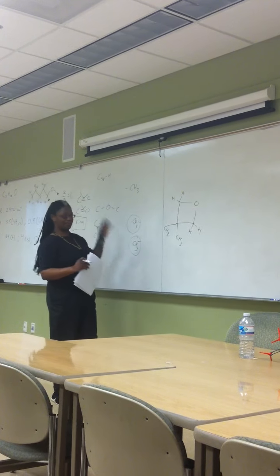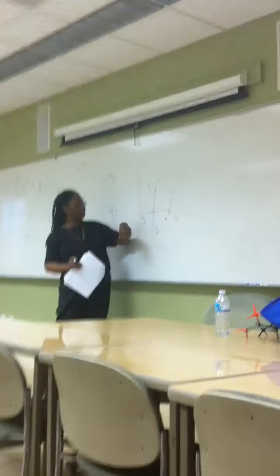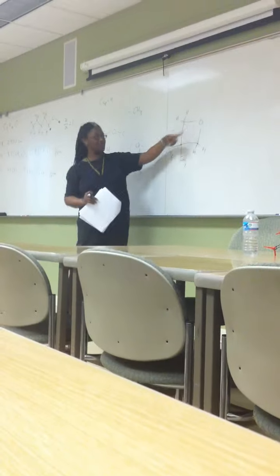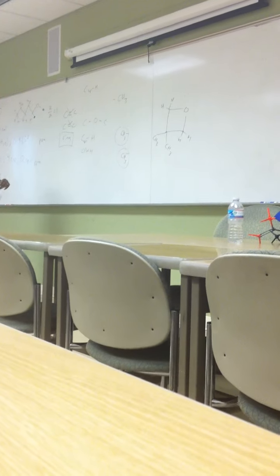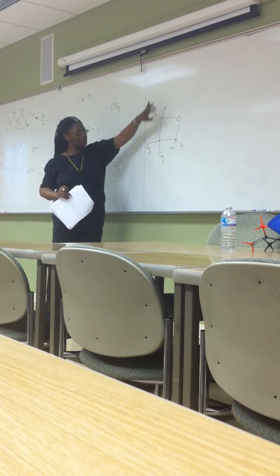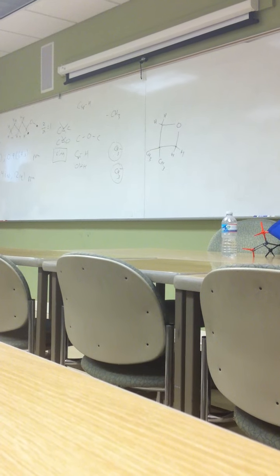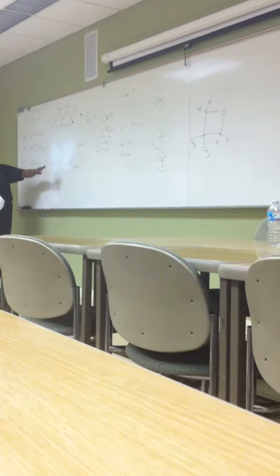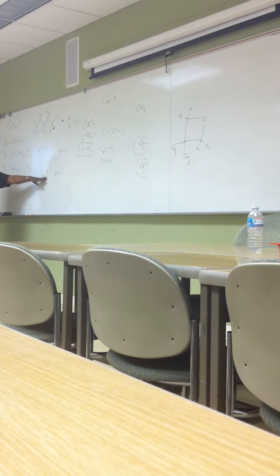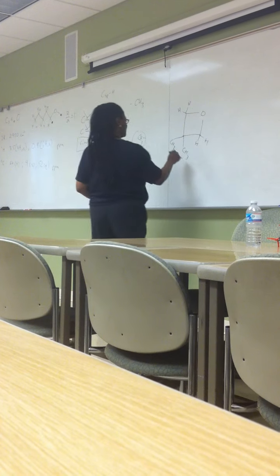And then again, just double check, make sure you have the right formula there. 1, 2, 3, 4, 5 carbons, 1 oxygen, 2, 4, 7, 10 hydrogens, the oxygen there, okay? And so everything matches, so we would expect integration for 6 here, and then 2, 4 there. We didn't even have to use the C13, but now we can look, we expect to see a triplet, singlet, and a quartet. So the quartet means a carbon that's attached to 3 hydrogens. Okay, so in this case, this is a carbon attached to 3 hydrogens.